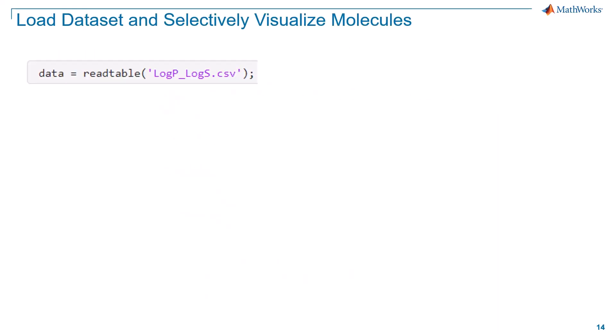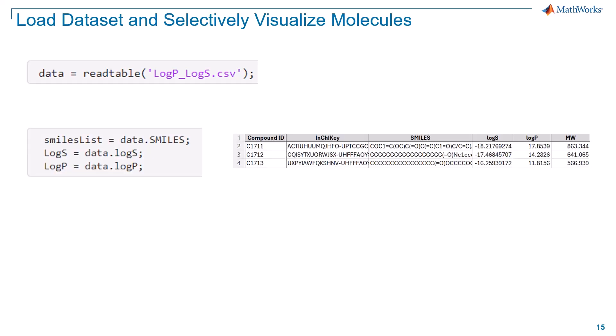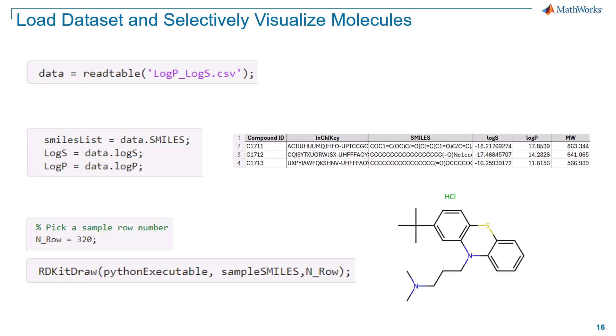Now, this example starts by loading the database into MATLAB. You can use the read table function for this purpose. It creates a table by reading column-oriented data from the CSV file. To access the data in the table, you simply specify the column headers. This way, you can simply draw any molecule by specifying its row number in the dataset.